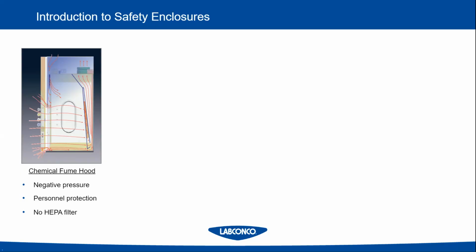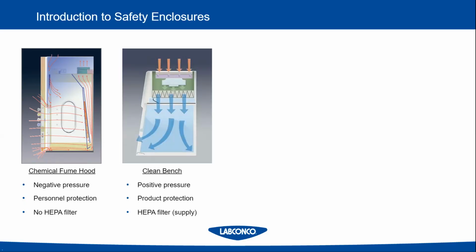This is great for chemical vapors, but actually not an ideal place to conduct cell biology research. That's because anything that's already in the lab on the outside of the fume hood goes directly over the sample. So let's say somebody sneezes or coughs, bacteria or viruses could be expelled, and those would land directly on the samples on the work surface of the chemical fume hood. So not an ideal place for conducting cell biology research.